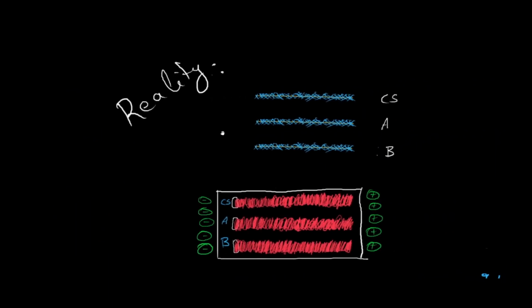Okay. And we also remarked how this is actually a totally fantastic scenario. What would actually happen looks more something like this, which is that you'll have lots and lots of cuts in any true human DNA sample. You'll have a lot of cuts for the restriction enzyme, and that would in fact lead to, instead of these neat, clean, sharp signals, these smears, which are virtually useless here.